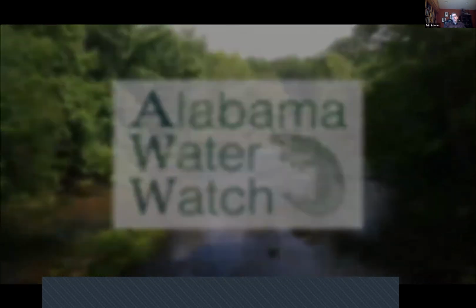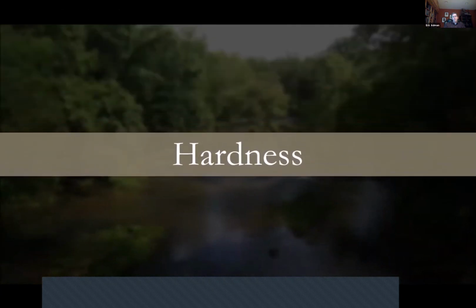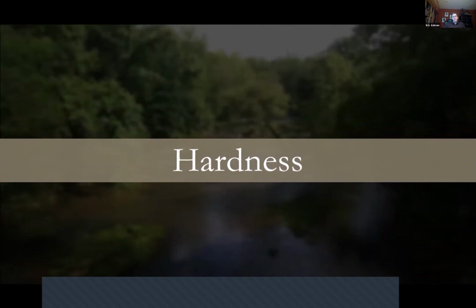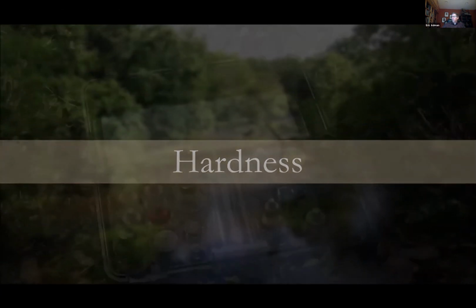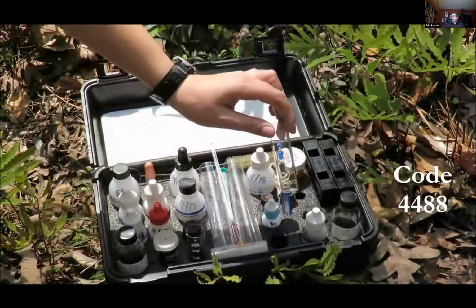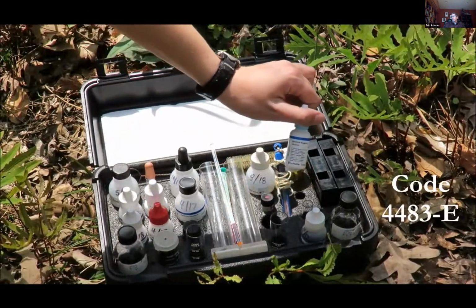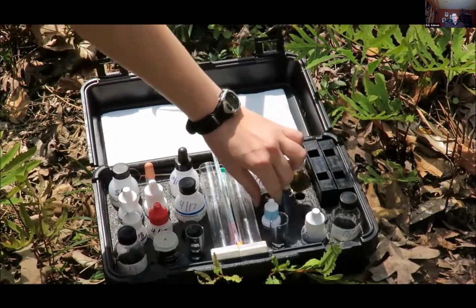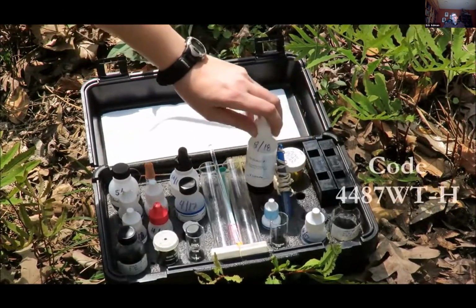This video will show the proper method for determining water hardness. If you are testing in coastal waters, be sure to conduct a salinity test first. If salinity is detected, do not perform the hardness test. For this test, you will need the hardness tube, hardness reagent number 5, hardness reagent number 6 tablets, and hardness reagent number 7.